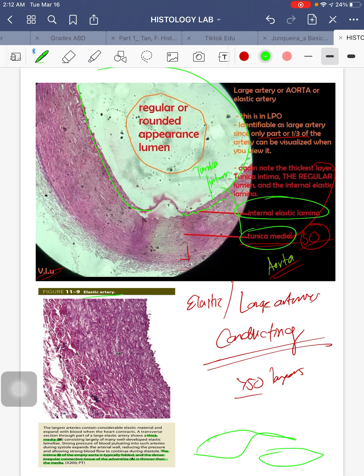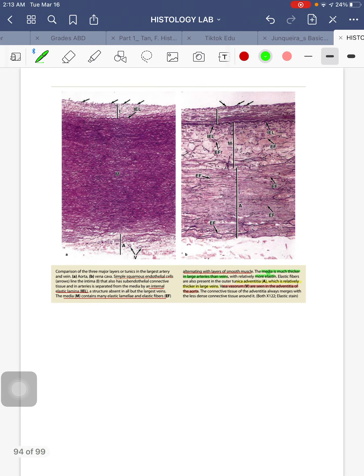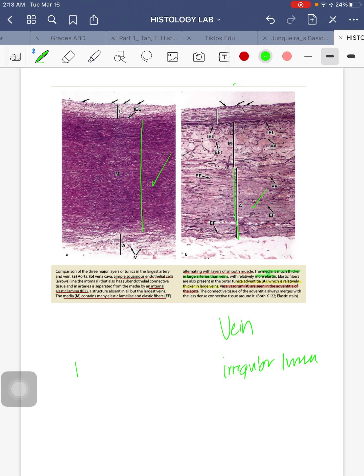The aorta is also known as your elastic or conducting artery. The second picture shows the thick muscular layer of more than 50 smooth muscle layers alternating with elastic lamina. To the right is your vena cava. With veins, the thickest layer is the tunica adventitia — as opposed to arteries where it's the tunica media. Take note: veins have an irregular lumen, while arteries have a regular, circular lumen.